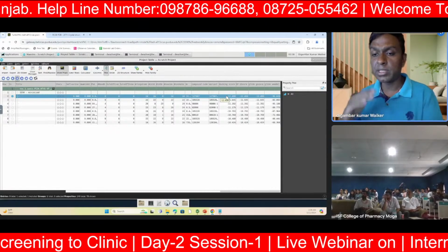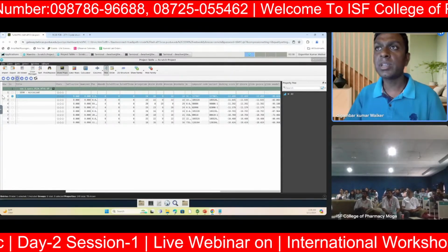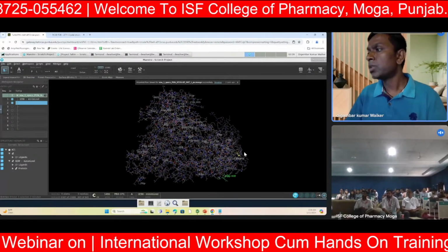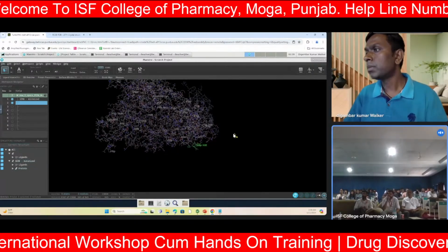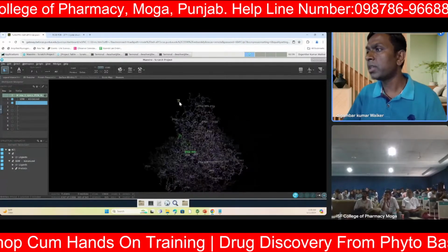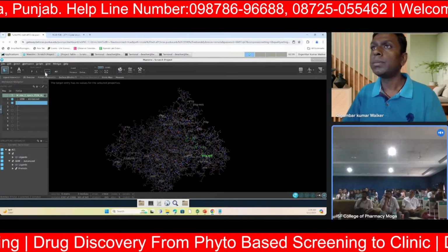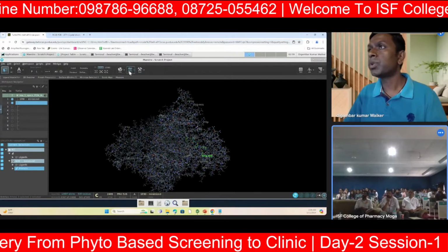which is better than the standard Erastin. And if we see the structure and the binding of that particular compound, we will see why it is showing better docking results. As you can see here, this molecule is also binding in the active site pocket, similar to that of the standard molecule. So let me show you that.